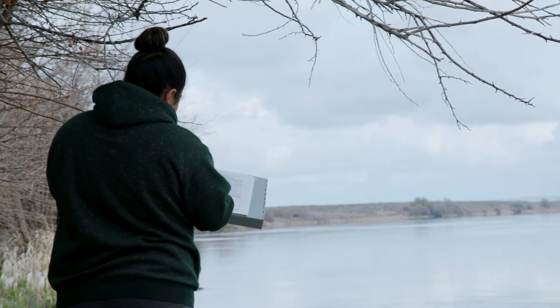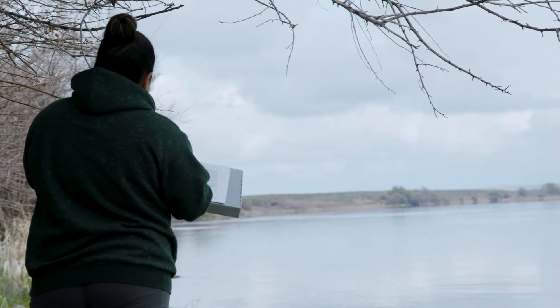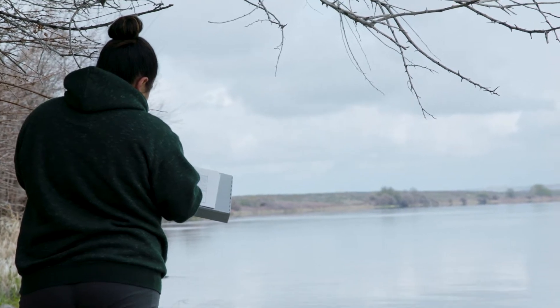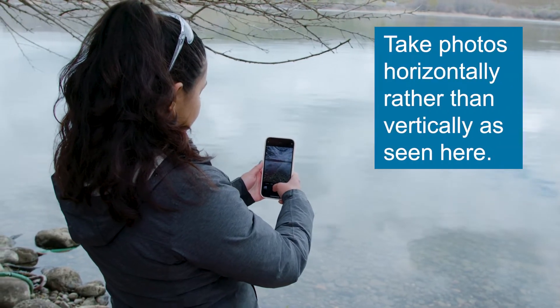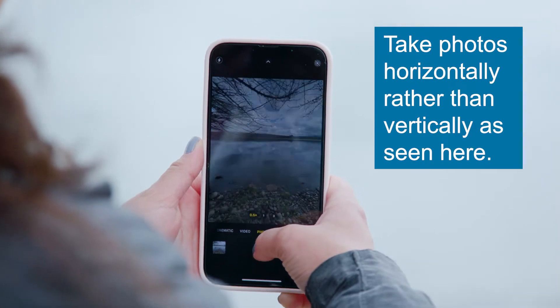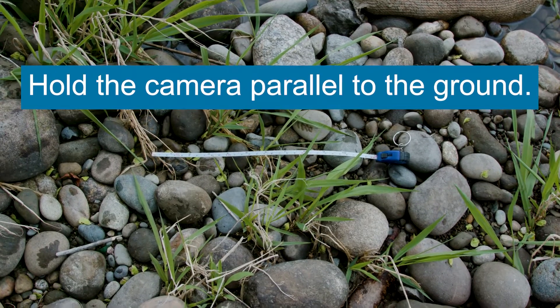Now that the sensor is deployed, you can fill out the rest of your metadata, including the latitude and longitude of the sensor and information to describe your surroundings. You will also take a series of photographs that will be uploaded with your metadata. The photographs should have a measuring tape extended to 30 centimeters visible in the picture. For the two photos looking down at the sediment, hold the camera parallel to the ground.